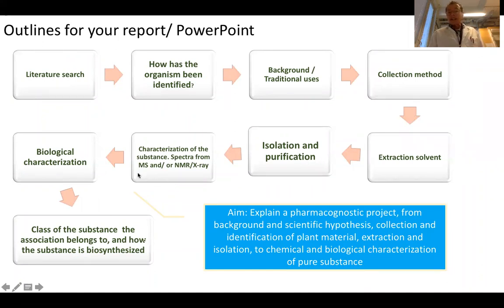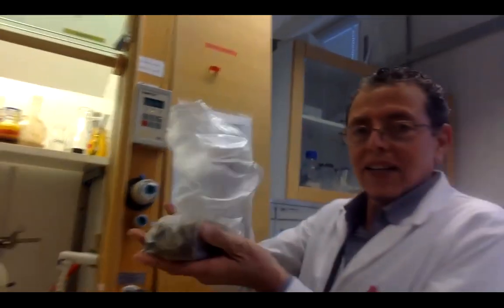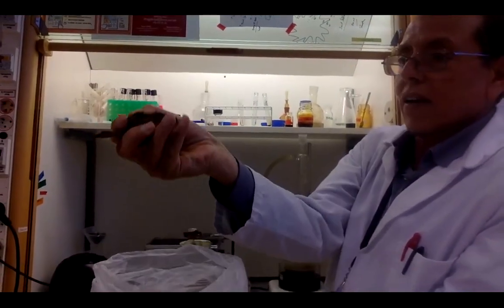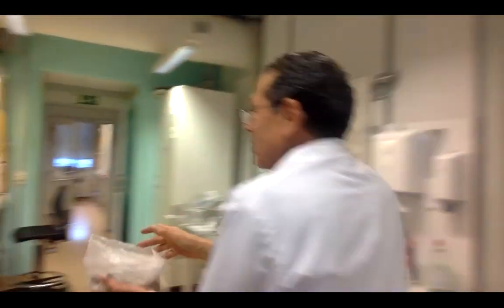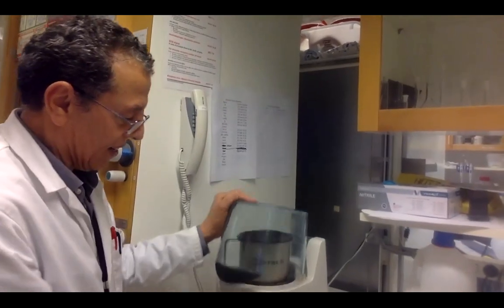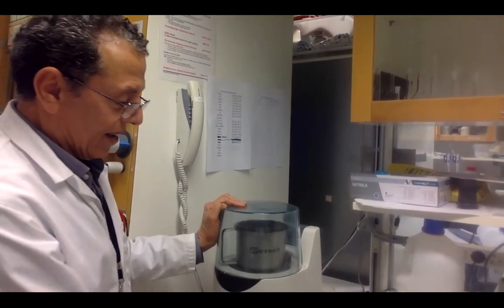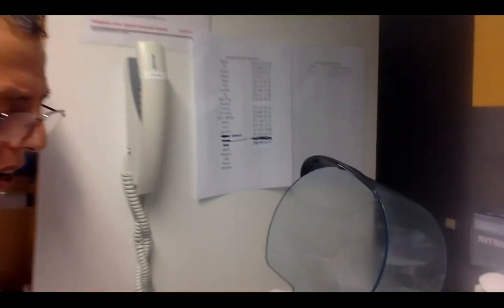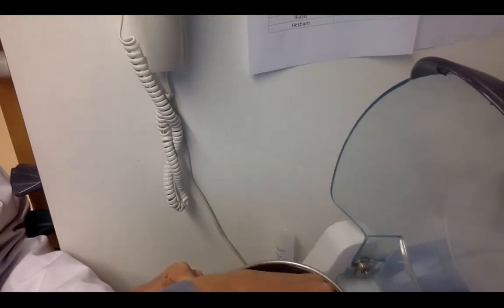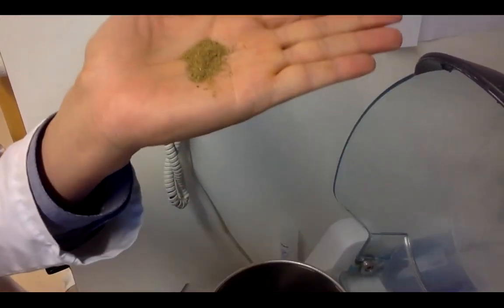Let us start with the extraction. We start with the plant material — here is the plant material. If it is this size, do you think we can do the extraction? I think no, it should be ground. So we use the grinding machine, which is like a kitchen machine. We put the plant material in and start it, and then we get the plant material in ground powder form, in very small particles like you can see here.